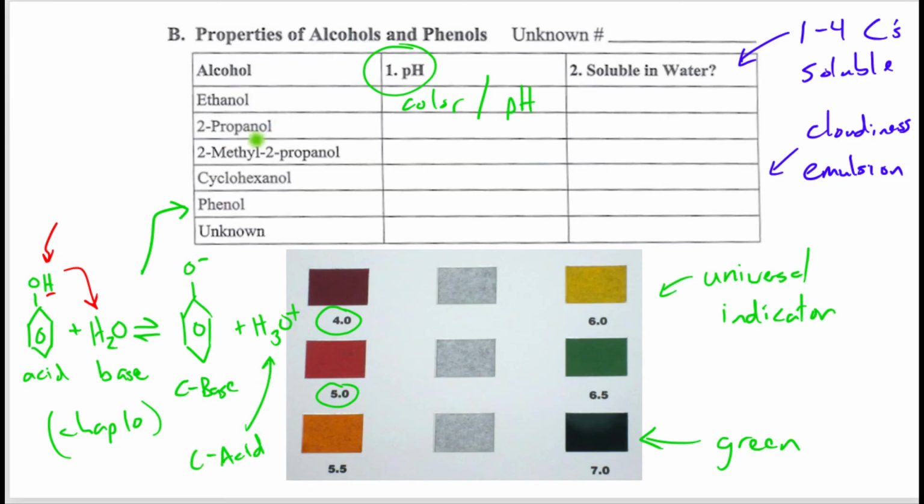None of the other alcohols do this kind of reaction. It also makes phenol more soluble than one would expect. Now, I'm not saying whether it's soluble or insoluble. I'll let you decide when you watch the video. But it does do something different, and it's all because of that aromatic ring there.